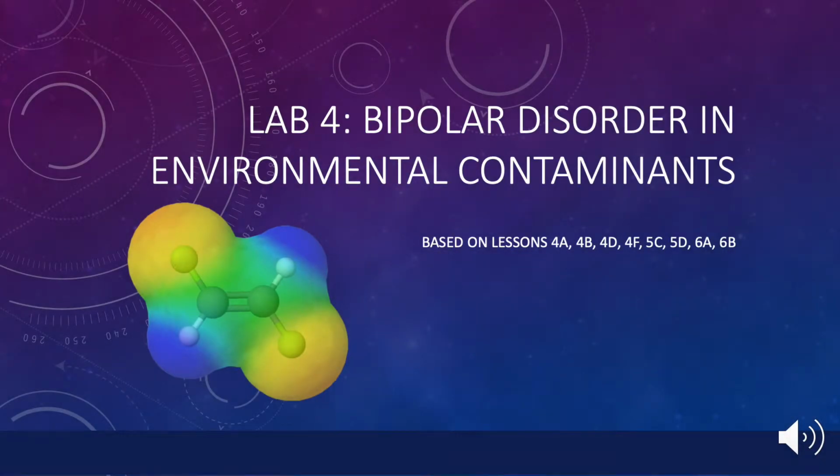For our last virtual lab exercise, you will have an opportunity to combine several different aspects of your knowledge of molecular structure to solve a structural puzzle. Specifically, you will employ your knowledge of mass spectra, infrared spectra, and elemental analysis to find the molecular formula for an unknown environmental contaminant containing only carbon, hydrogen, and fluorine.